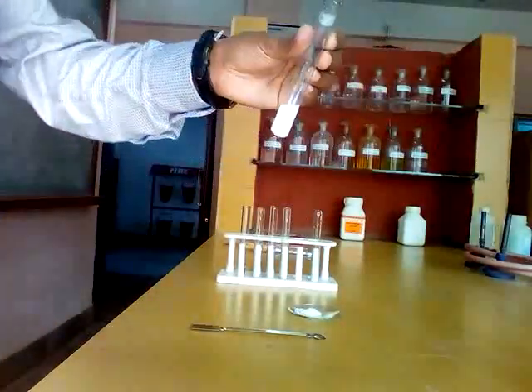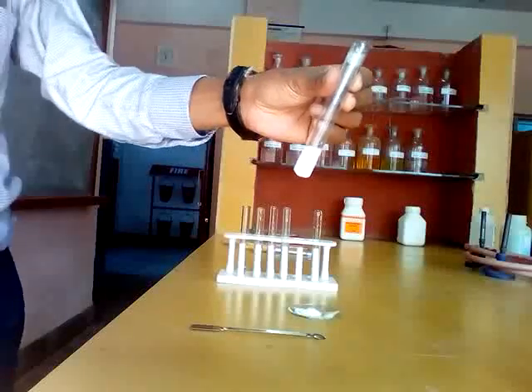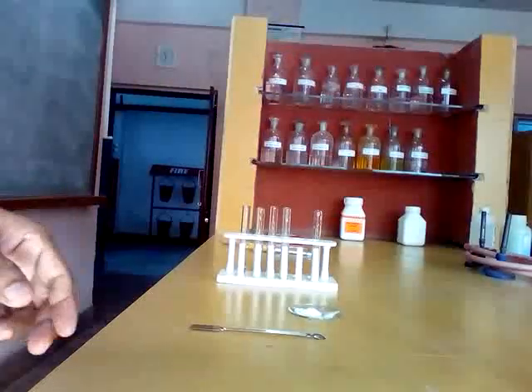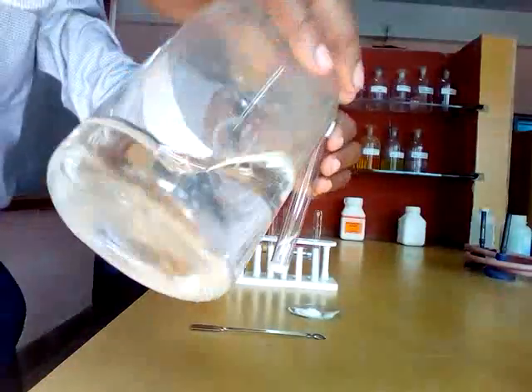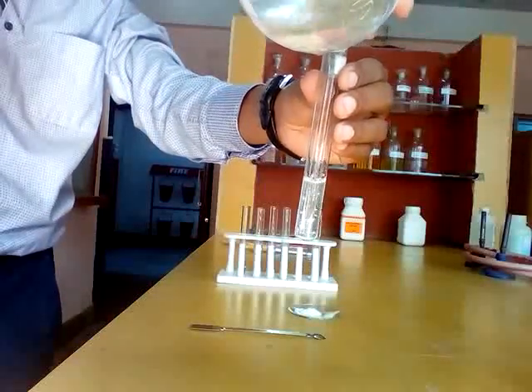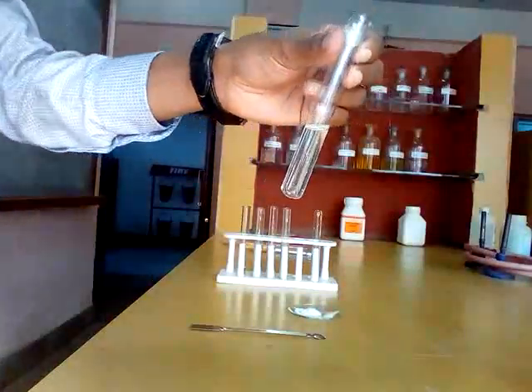So we got white precipitate. This is the precipitate of silver chloride. This precipitate will dissolve in ammonium hydroxide. This is the ammonium hydroxide. You put ammonium hydroxide here. Now you see the precipitate is dissolved. This is transparent.